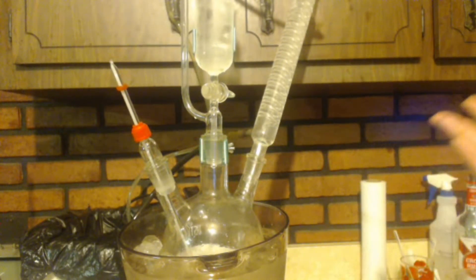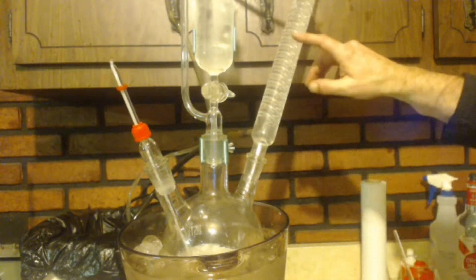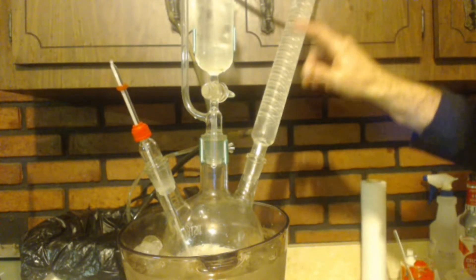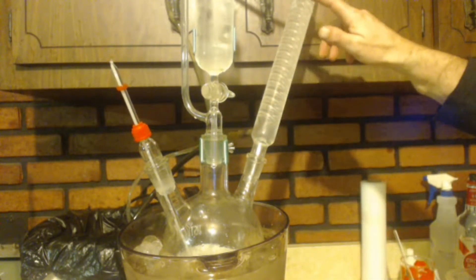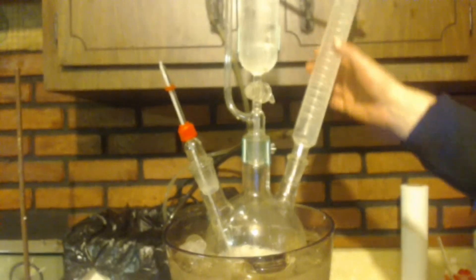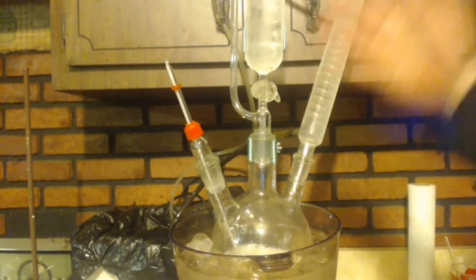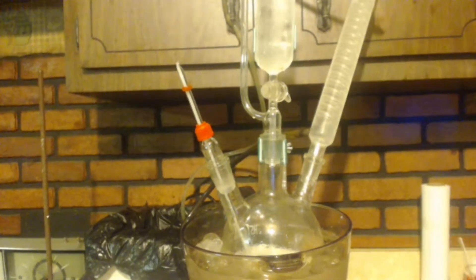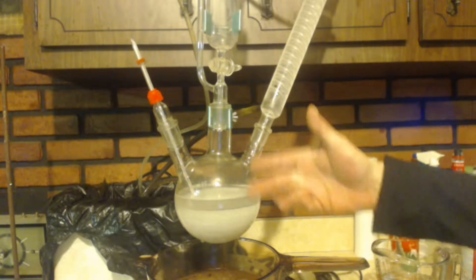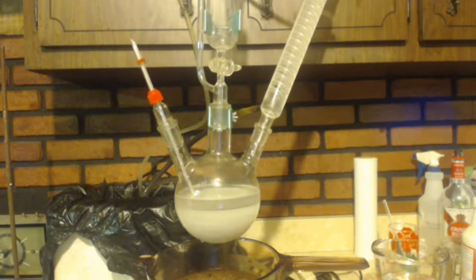After dripping in about 10 milliliters of water, I had to stop because it shot up through the Graham condenser — I was like, whoa! So I turned the cooling water on for the condenser and then started dripping again. Hopefully the condenser will keep the heat under control; if not, I'll just pause the drip and let it cool. I probably put a bit too much water in at the end since the temperature stopped rising, but too much is okay — too little is not.